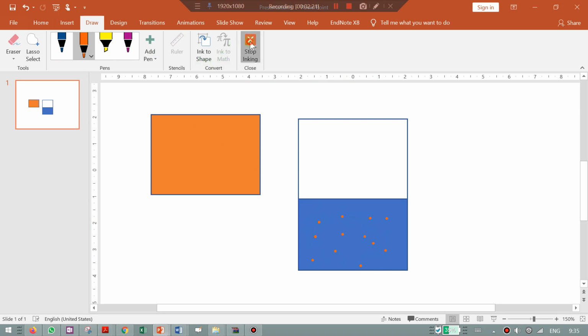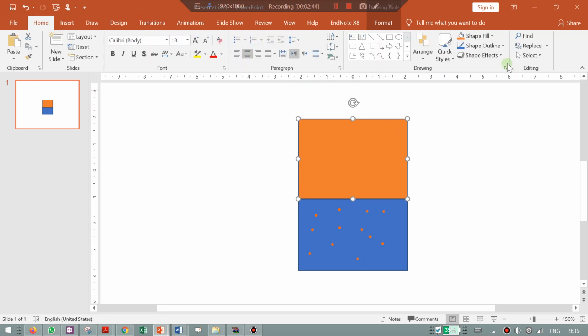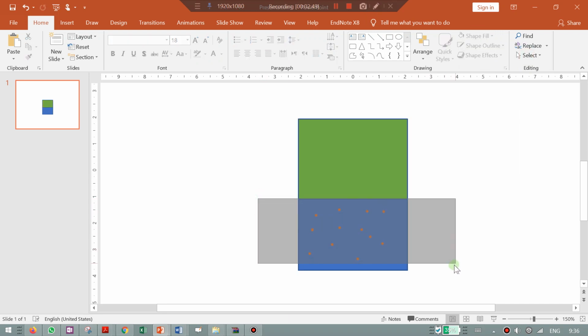After we put the solvent of extraction, we hope that ideally, better I change this color into maybe green one, all of our analyte of interest will transfer into the solvent of extraction.